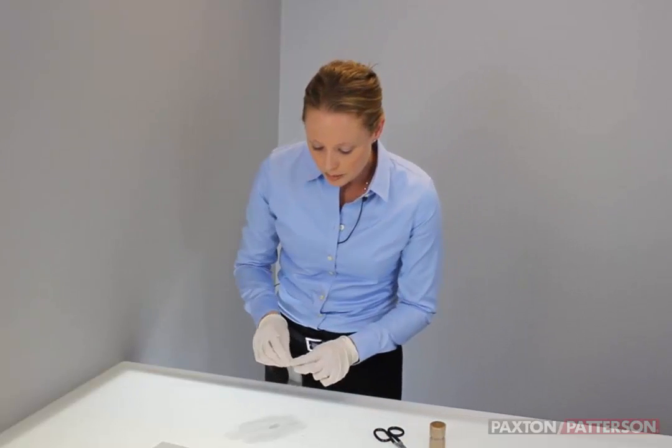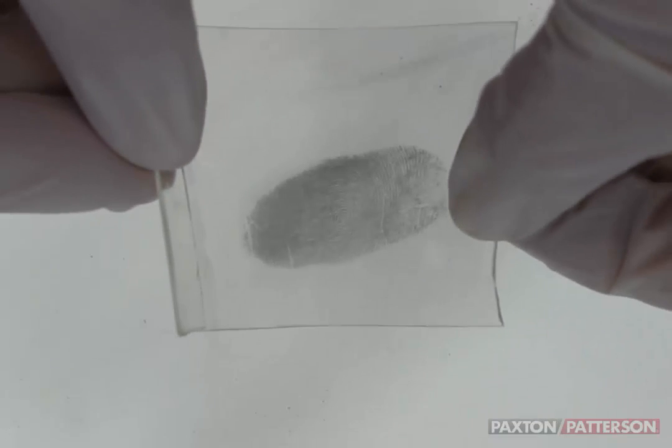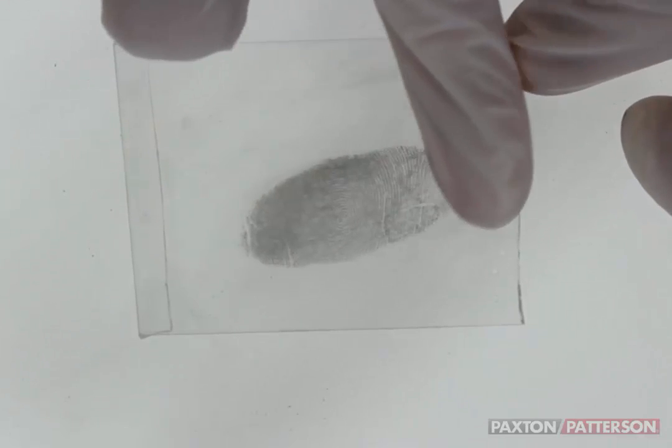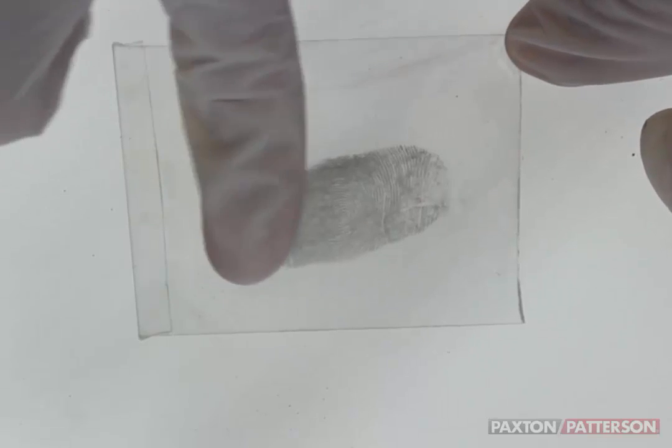You can see the print on the table. I'm just going to hold the end that I've folded over, sit it right down, and smooth the edges down. The tape can move sometimes, so I do like to hold the corner as I smooth the tape out.